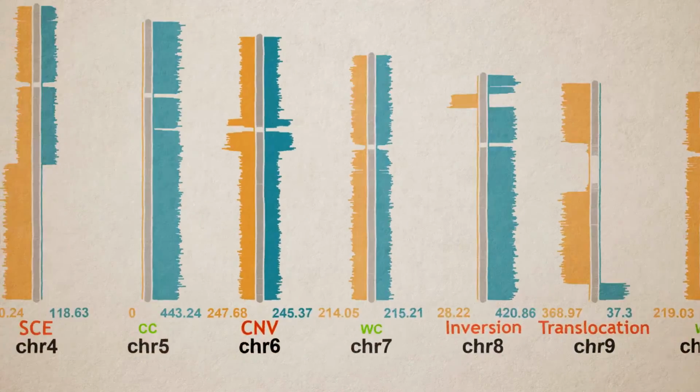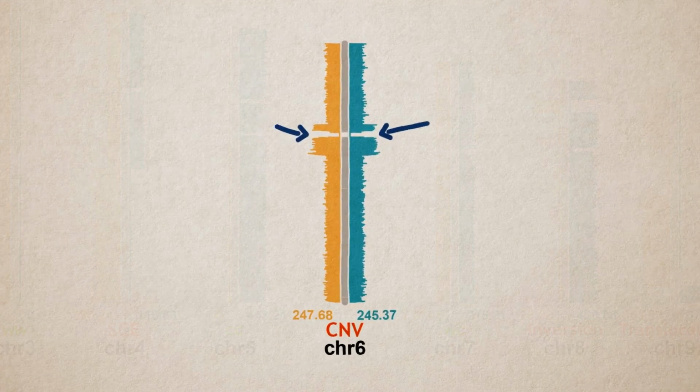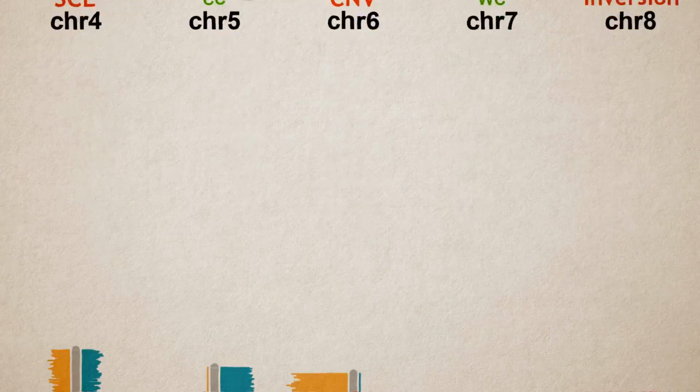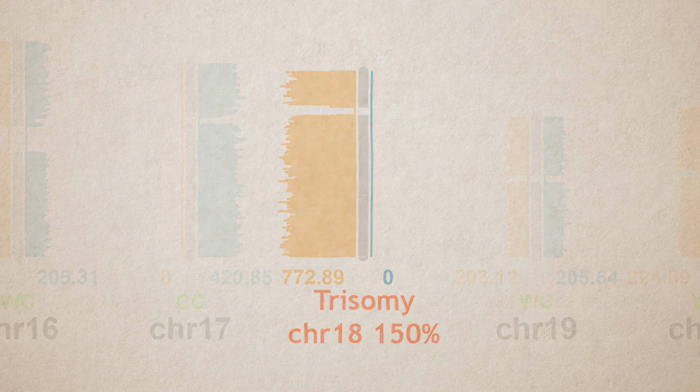Strand-Seq can also be used to detect chromosome copy number variations across the genome. It is also possible that chromosomes are not evenly divided over the daughter cells, resulting in a cell containing, for example, 3 copies of chromosome 18, trisomy.